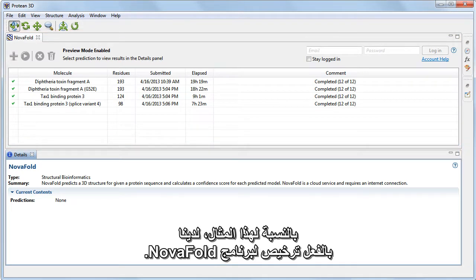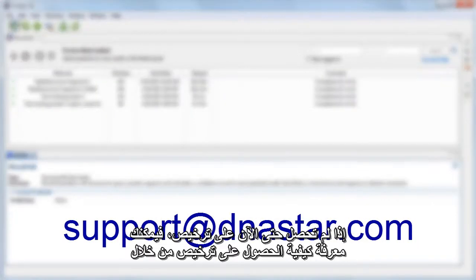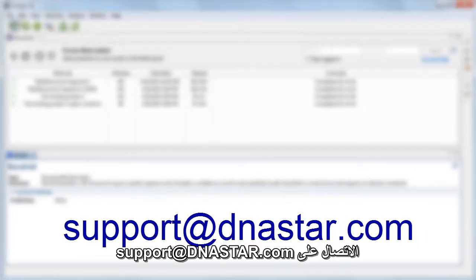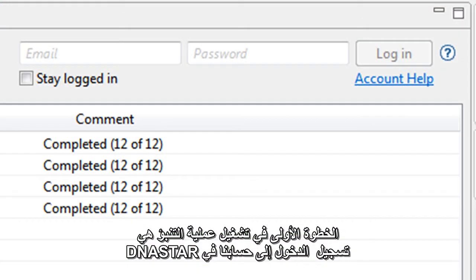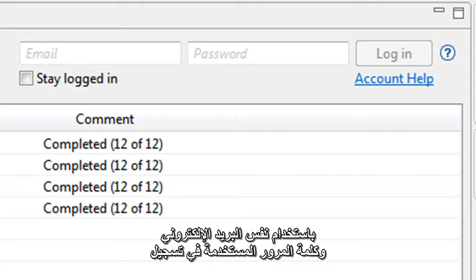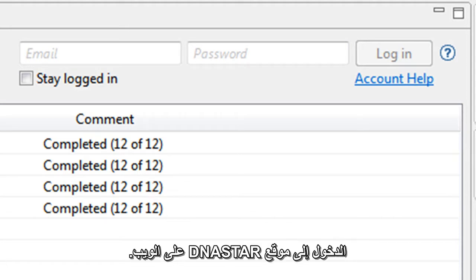For this example, we already have a valid NovaFold license. If you do not yet have a license, you can learn how to obtain one by contacting support at dnastar.com. The first step to running a prediction is to log in to our dnastar account using the same email and password used to log in to the dnastar website.